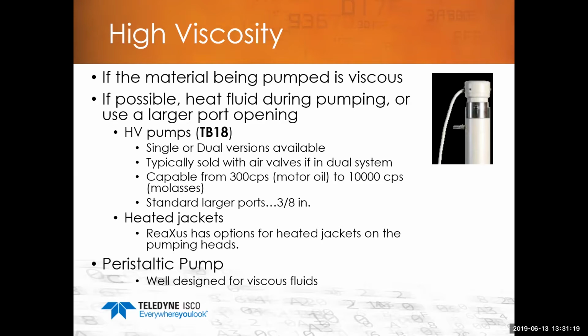And in peristaltic, that is the pump for viscous materials. You can probably push gum through there if you really needed to. So there's 3 different ways that if you're worried about highly viscous materials in your flow chemistry application, this is how I would take a look at it. And I would say probably if you weren't so worried about pulsation, peristaltic pump is the way to go.